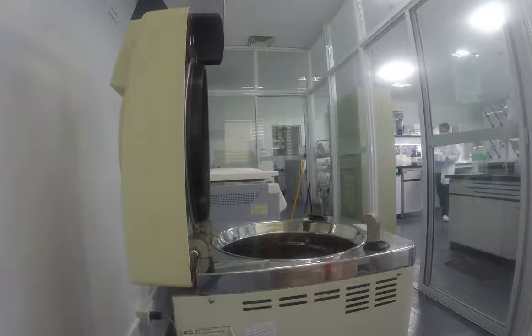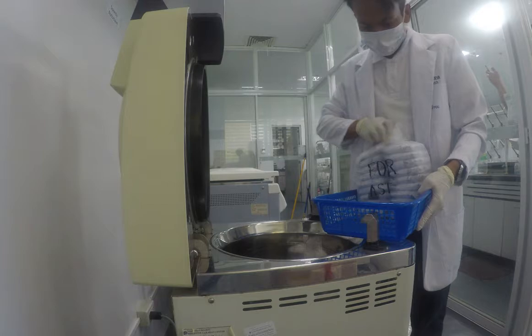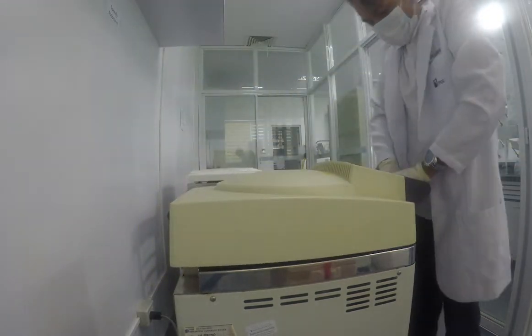Sterilization of laboratory wares and culture media is done by subjecting them to high-pressure saturated steam at 121 degrees for around 15 to 20 minutes depending on the size of the load and contents.